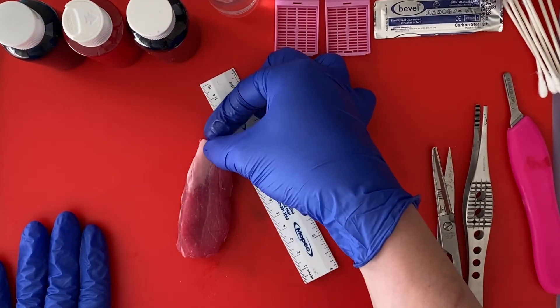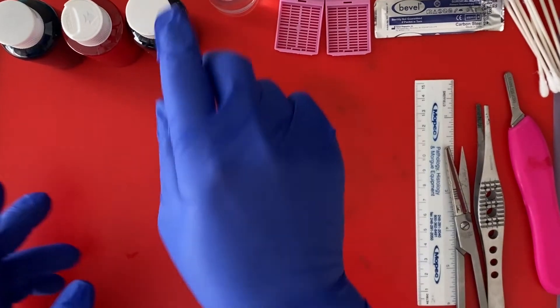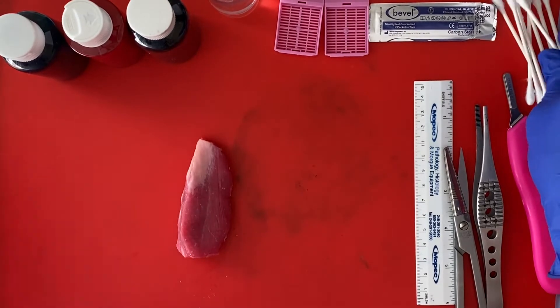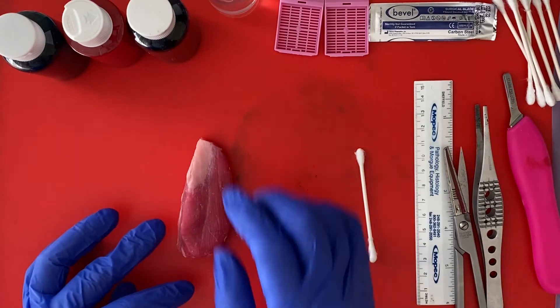Sometimes specimens come oriented with a suture on the superior pole, but not always. I have three different ink colors here. I'm going to do anterior one color, posterior another color, and isthmus margin a third color.